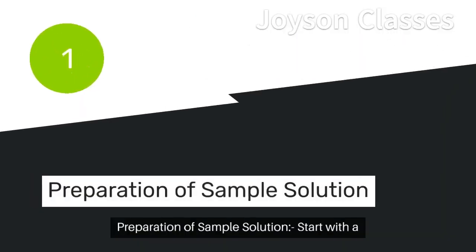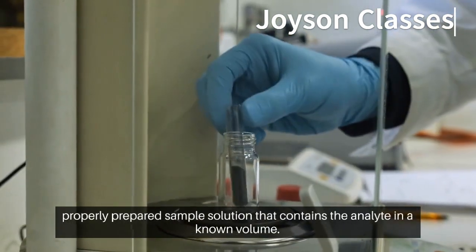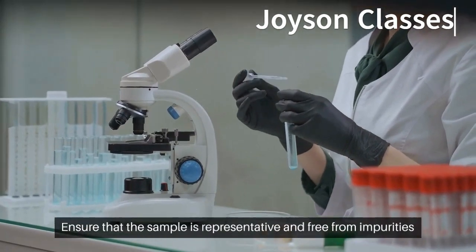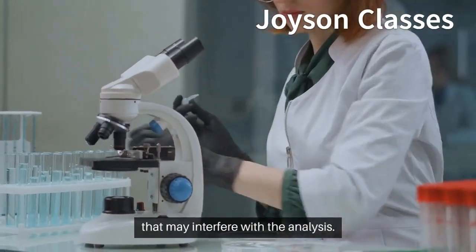1. Preparation of sample solution. Start with a properly prepared sample solution that contains the analyte in a known volume. Ensure that the sample is representative and free from impurities that may interfere with the analysis.